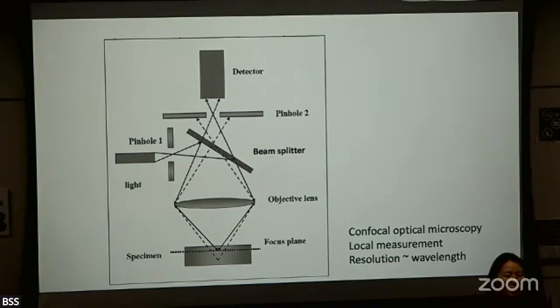But for devices on silicon substrates, usually reflection is the mode. Okay. So the measurement is simple. How do we get response from this measurement? So this is what I'm going to talk about in the next 20 or so minutes. So first, let's just model this.